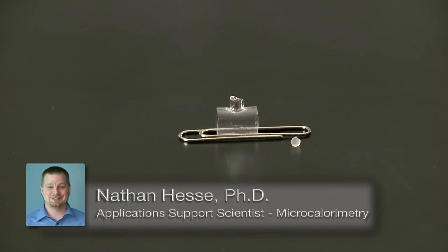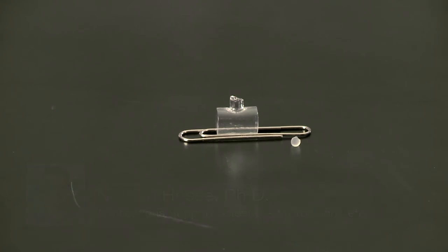This is the TA Tech tip on how to seal the crushing ampules for the precision solution calorimeter, otherwise called the SolCal.